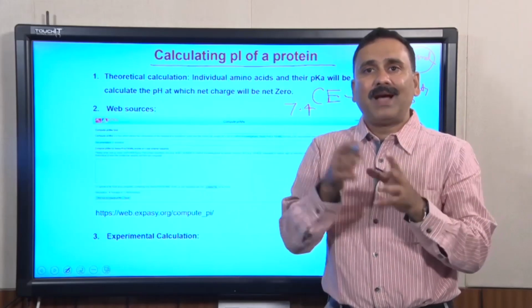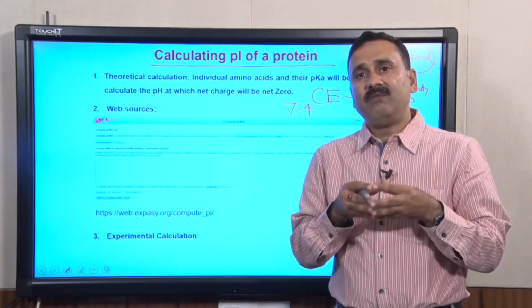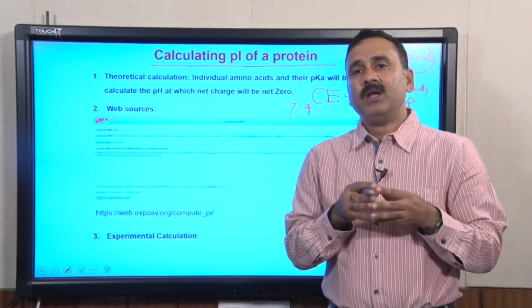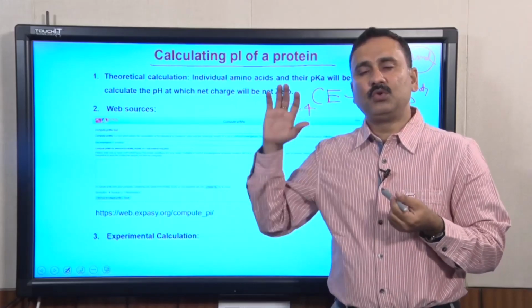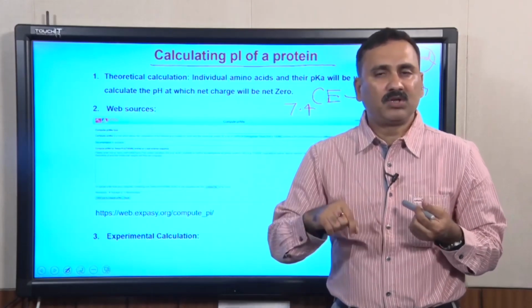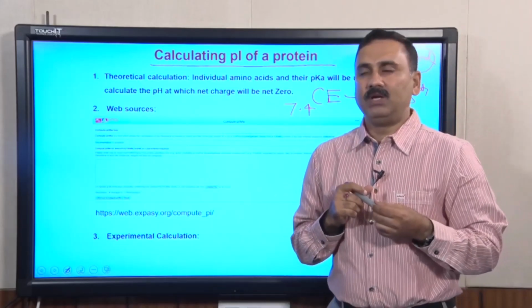But this kind of trial and error method was used when people did not have any information about the pI values, the amino acid sequences, or the genomic sequences. But nowadays you have different types of approaches, so you should not go by the trial and error method. You can very precisely use cation exchange chromatography or anion exchange chromatography by simply calculating the pI values, and there are three approaches by which you can calculate the pI values.